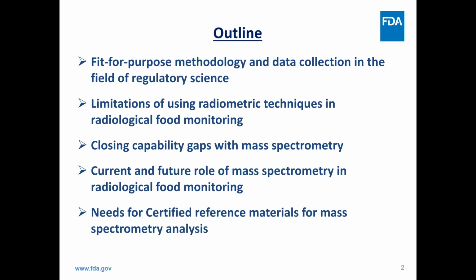Here we are. The presentation will discuss 5 aspects of using mass spectrometry in radiochemistry.